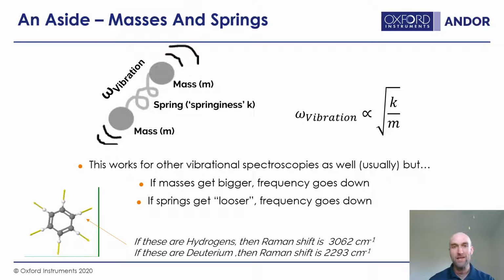And you can already think, wow, I can use Raman for isotope identification. And there are situations in which you can. I just wanted to throw in one of these things. You can also look at when bonds get stronger or weaker, if electrons are pushed into a bond or pulled out of a bond. I don't know how much we're gonna touch on this today, but we're gonna see some other interesting applications for Raman shortly.